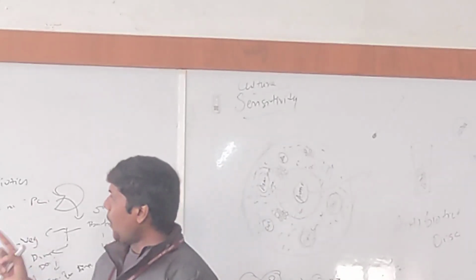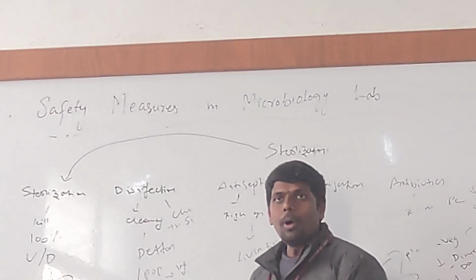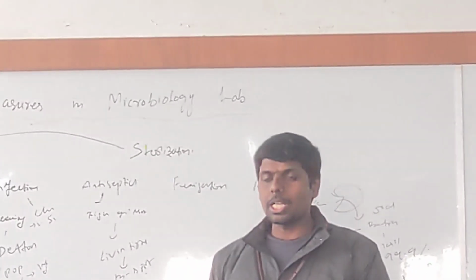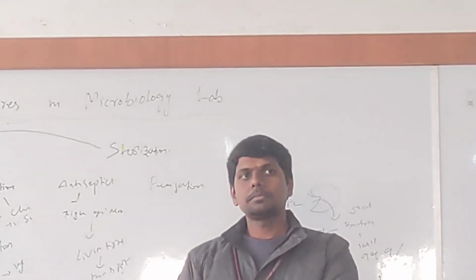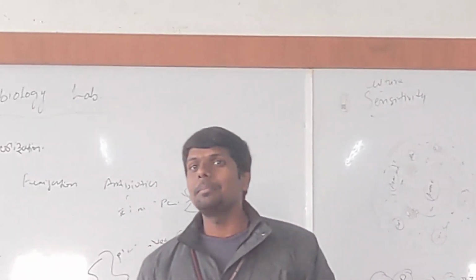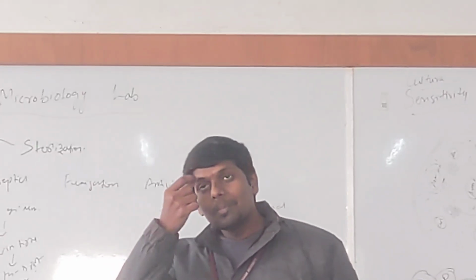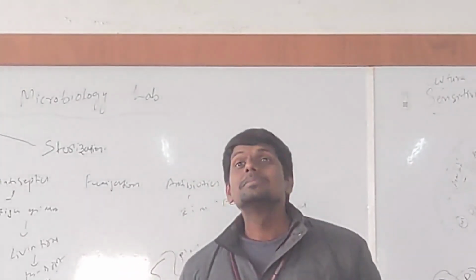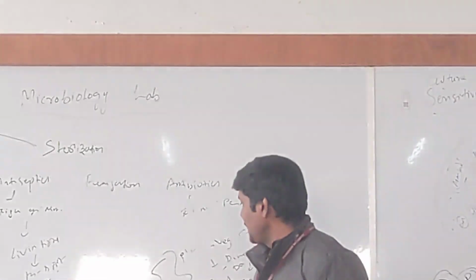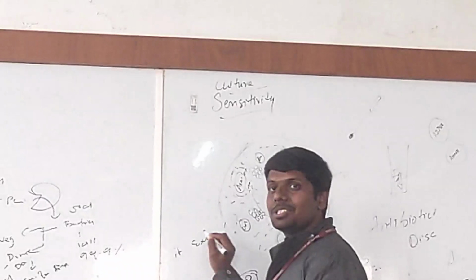Now we are focusing on sterilization in microbiology. Why do we need to sterilize, by the way? What is the purpose of sterilization? Kill all bacteria. You kill everything. Why are we killing everything when we are studying them in the first place? Sir, so that it could not react with the external environment and the microbes in the external environment. Justify?